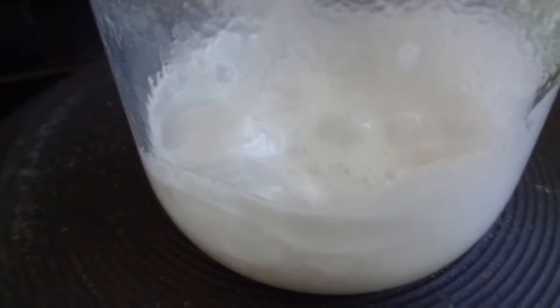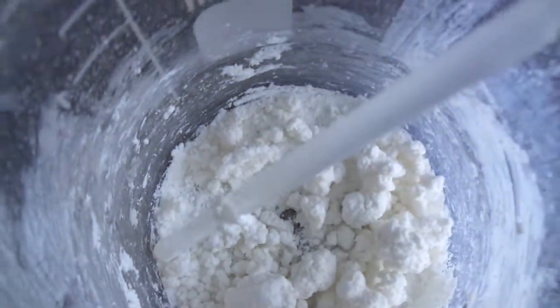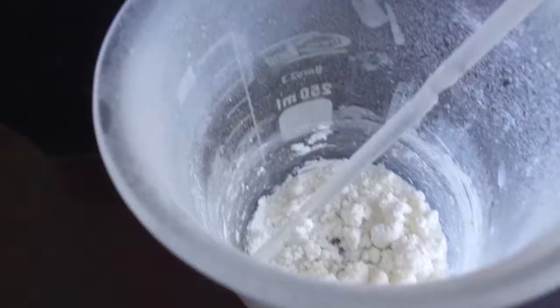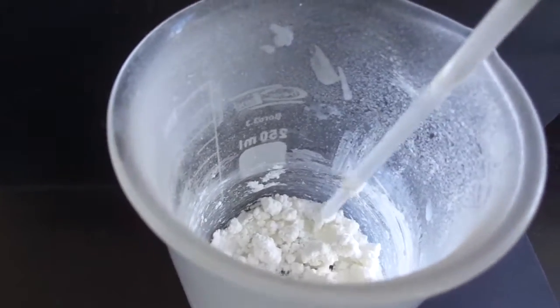It seems like we're almost finished, and we're going to wait until this stuff solidifies, because that means all the urea is gone — at least I think so — and we're left with only our product. That's the result of this reaction, and now we're going to separate and purify the products.